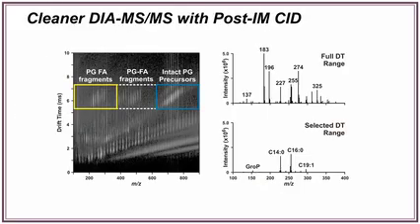And so the last benefit here is the structure of the ion mobility setups in these instruments. Most of them include a way to do fragmentation, collision-induced dissociation, after everything has been separated in the drift cell or by mobility. So whether it's the drift tube instrument, traveling wave, or the trapped ion mobility, the collision cell is usually after the ion mobility separation. And because the mobility part is the slow step and the fragmentation and the mass analysis are much faster, the fragments all end up having the same drift time as the precursor.